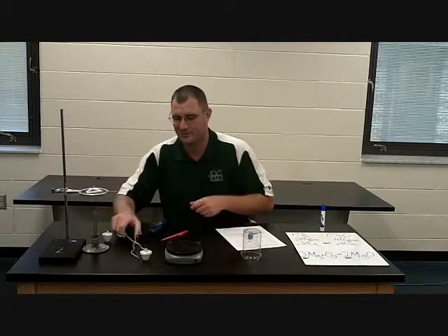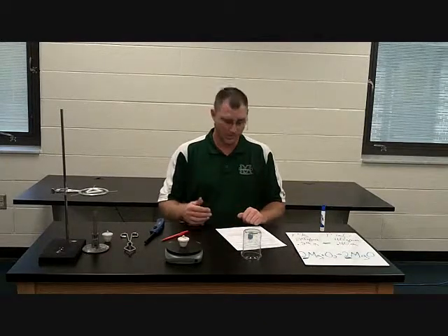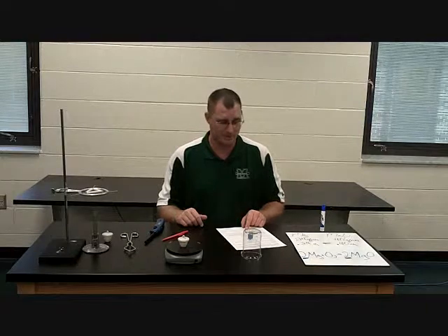I've got a pre-done sample. I'm going to take it, pick it up, put it on my scale, and weigh it again. Now before I weigh it, I want to predict what I think is happening. Almost all of my students go, well, I burn wood, and when I burn wood it gets lighter. So it weighed 19.84 before. Most of them said it was going to weigh about 19.7 afterwards. That was kind of our average.